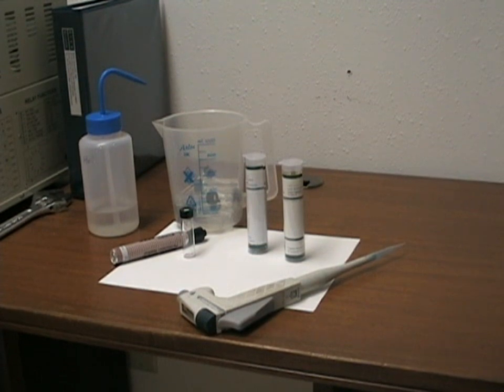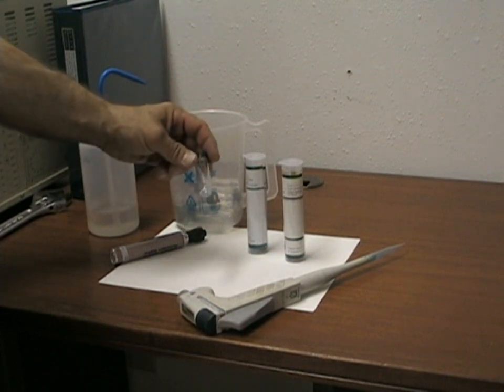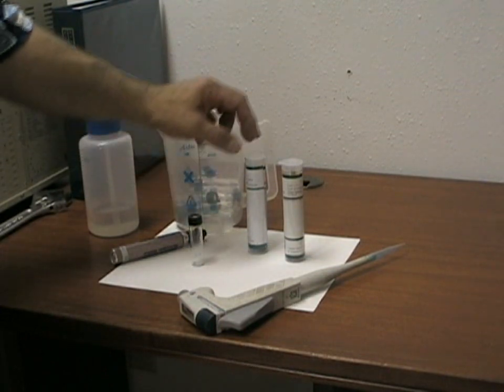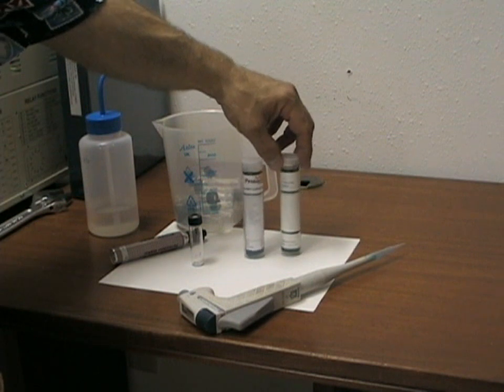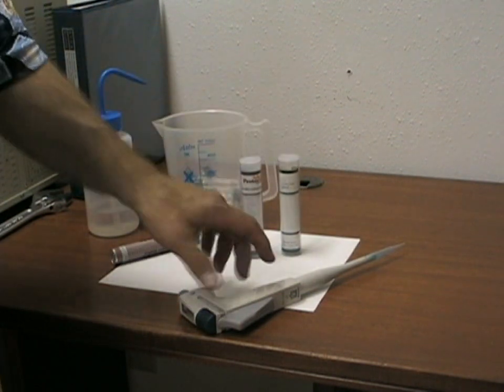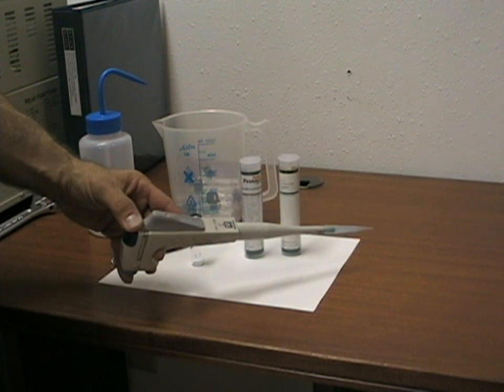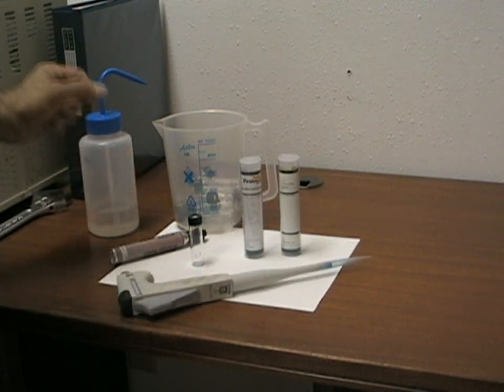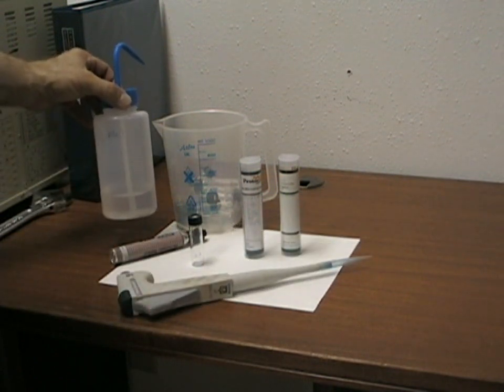This is the procedure for preparing a 100 part per million working standard to calibrate the GC instrument. 100 parts per million is the equivalent of 0.1 grams per liter. You will need glass storage vials to hold the diluted standard, the concentrated calibration material, a digital pipette to measure small volumes of the standard, and deionized water to make the dilution.